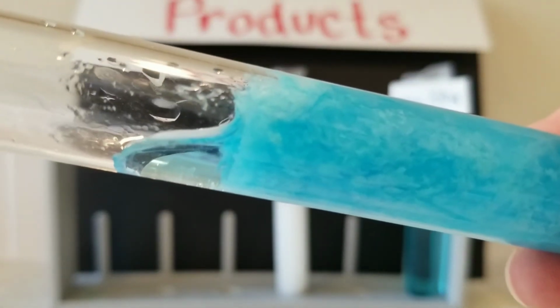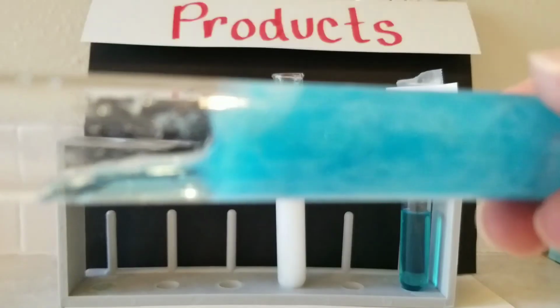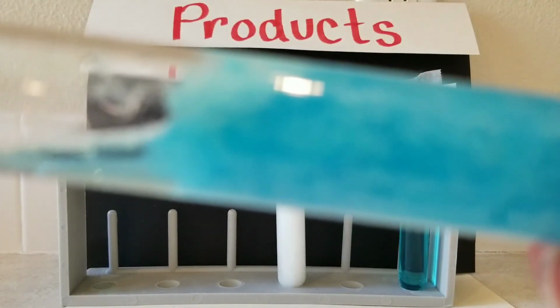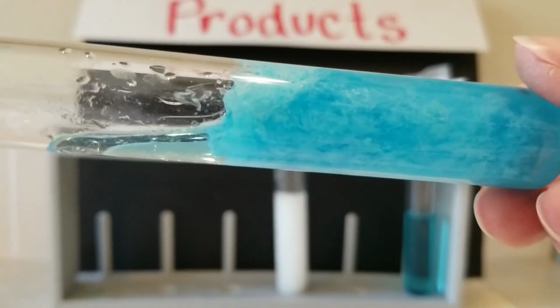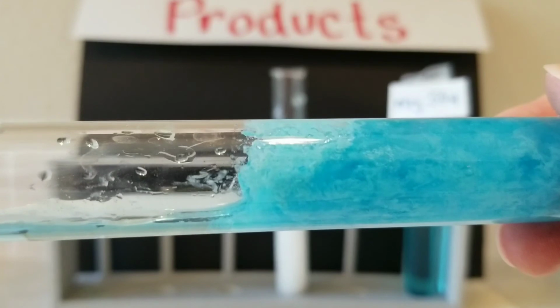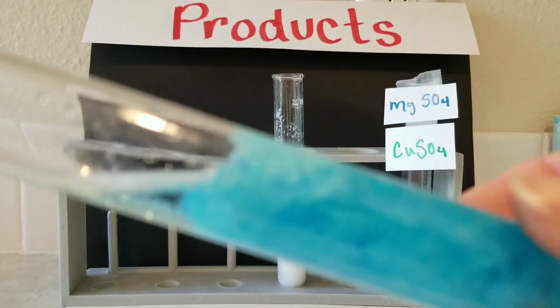You can see in there that the liquid has really separated from the rest of the material that's in the container. We can pour the liquid back down into, and then we can see, come on, focus. We can see the liquid, there we go, that separates out, leaving that cloudy junk behind in the test tube.